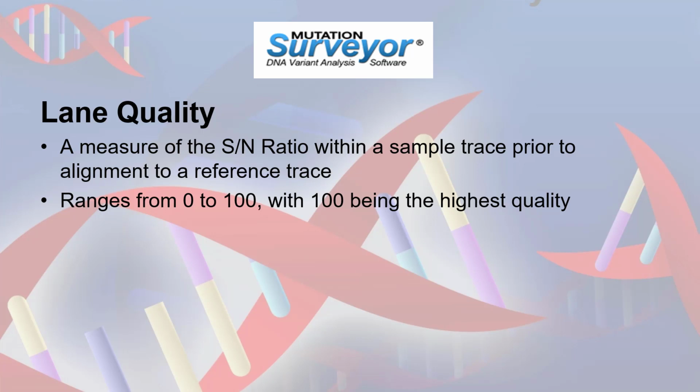However, the lane quality uses signal-to-noise ratio instead of Phred score and is calculated for the entire trace prior to alignment. Lane quality scores can range from 0 to 100, with 100 being the highest quality. Please keep in mind that a lane quality of 0 does not necessarily indicate a poor quality trace, as this can also be indicative of a heterozygous indel event present in the sample.